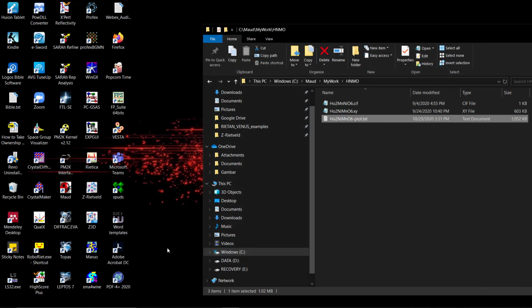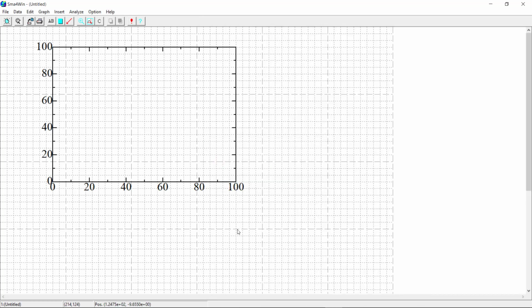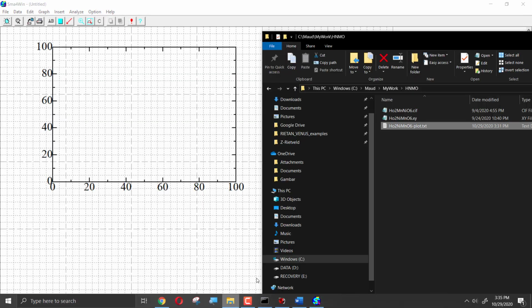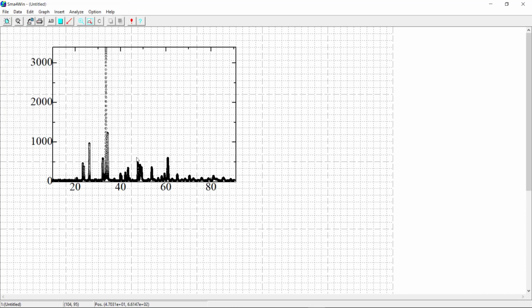I usually use this software over here. Okay, just simply drag and drop this data. Okay. So why plot error? Oh, I must close this one first. Now move over here, 1 to 2. Okay. I change to 1.5, the circle, and then the width of the line of the circle. You can see, yeah.